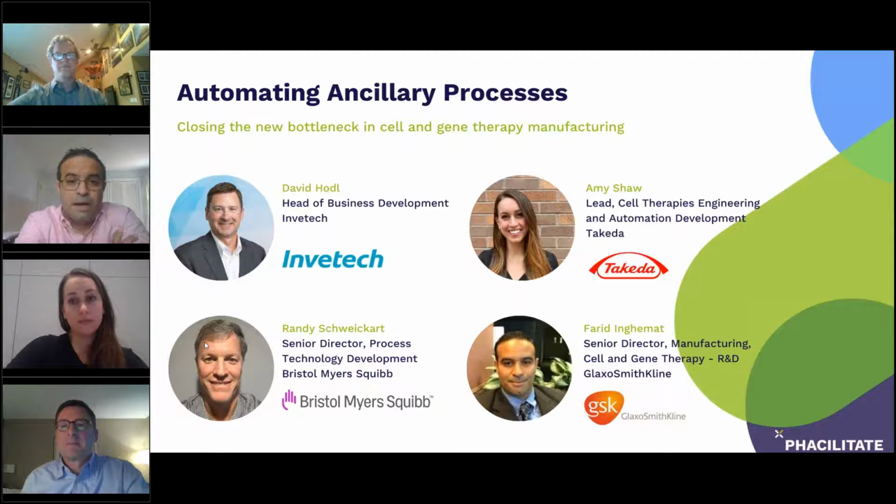The message that I would send is, start to think about automating the systems at the vendor and starting to provide closed systems, smaller volumes, tubing sets that work for us, both from an ID perspective, but also the material of construction.